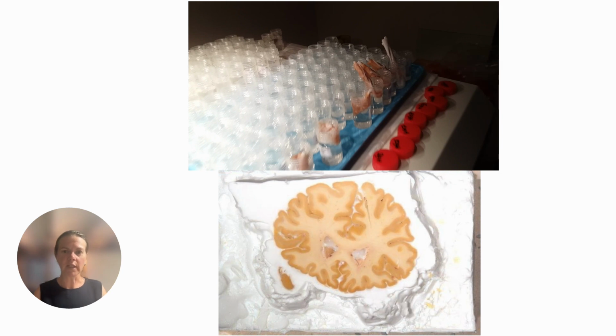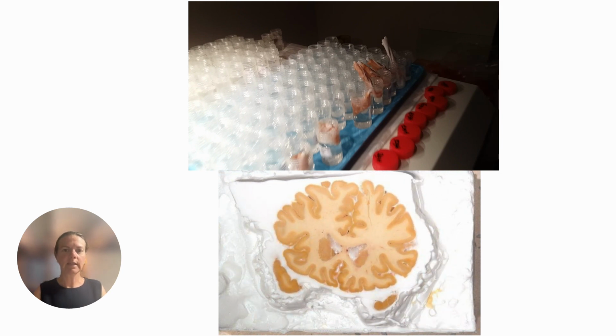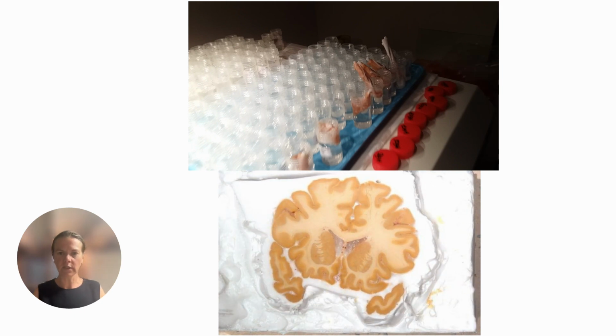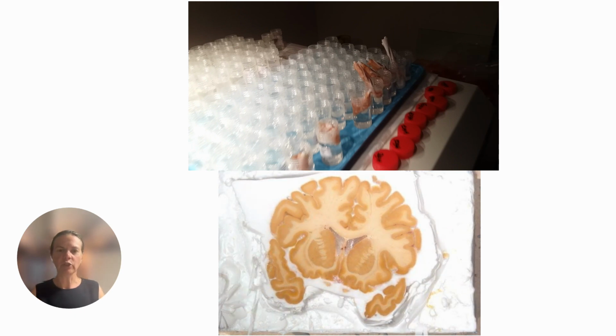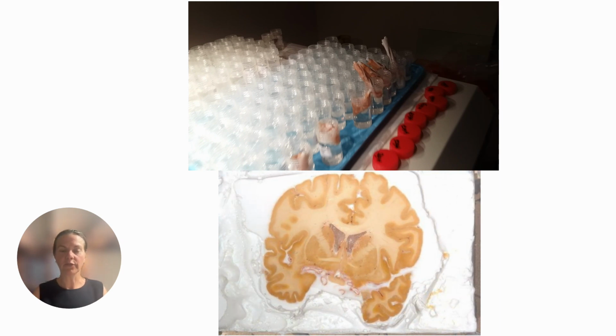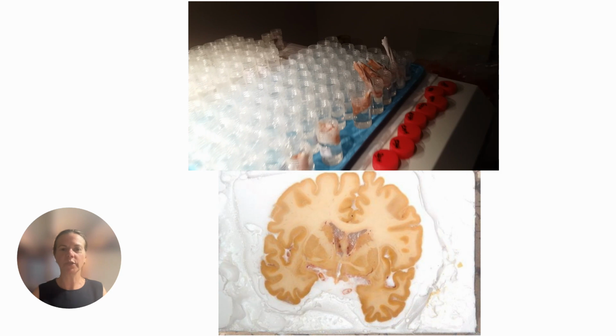Now what you see running in the bottom here is the block phase imaging. So every time we section, we take a picture of the tissue block that is left. And if we recreate all of these photos in a stop motion movie, this is what you get.